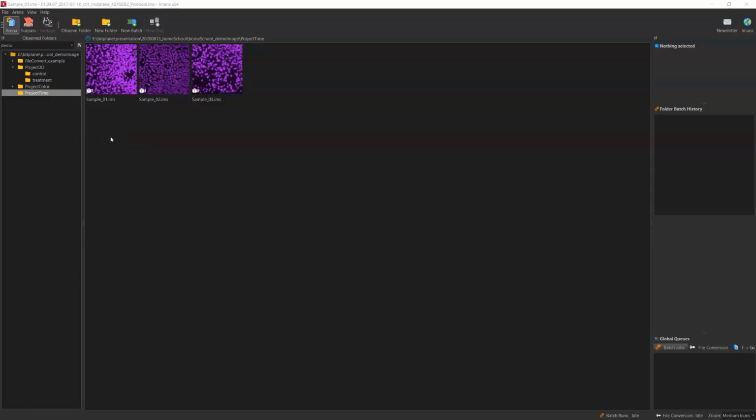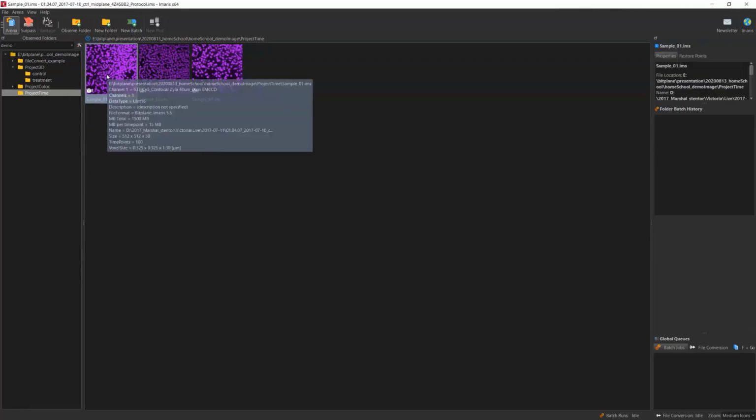In this second example, I want to share with you a time-lapse data set. Let's take a look at one of the examples.